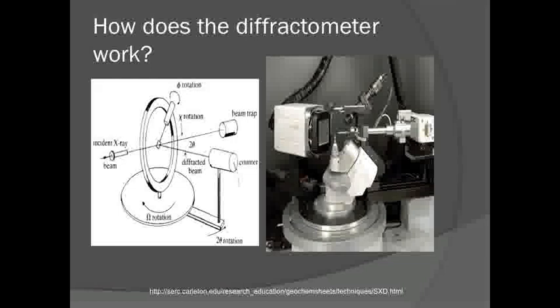Diffraction itself requires a specific wavelength, so the X-rays are either passed through a foil or a crystal monochromator. After the X-rays have passed through the wavelength selector, the rays are collimated. The X-rays strike the sample and constructive interference occurs when Bragg's equation is satisfied. It is the diffracted X-rays that are recorded by the detector, so the resultant diffracted direction of the lattice are obtained by changing the angle of incidence along with the orientation of the centered sample.